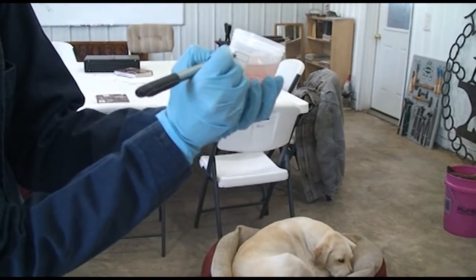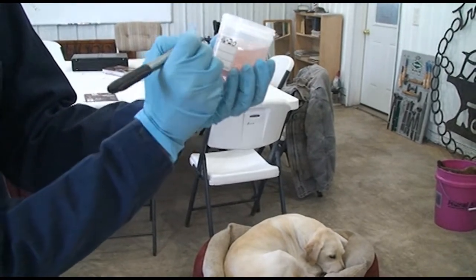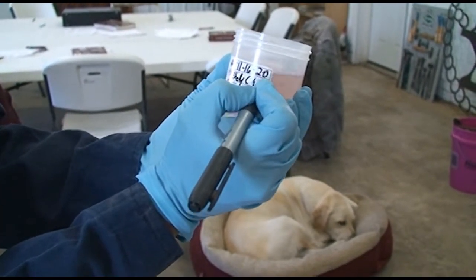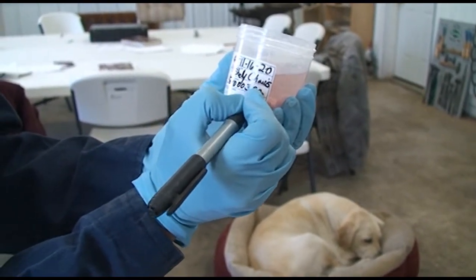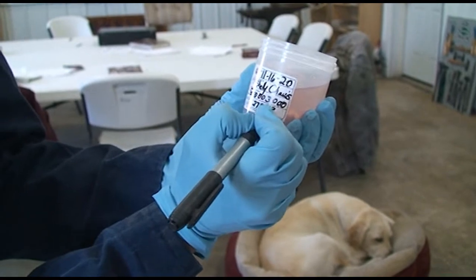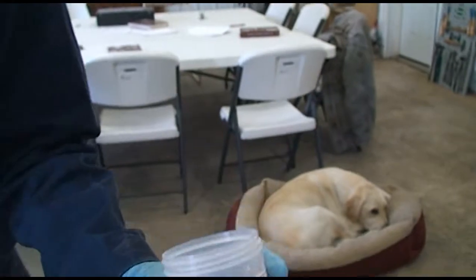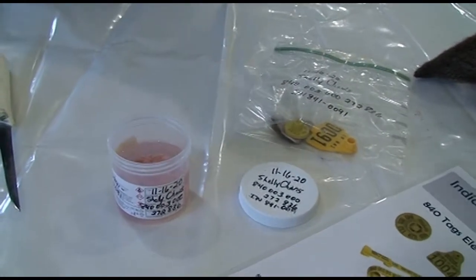And you don't have to use the sections that are listed on the formalin jar. You can just, the date's nice because it's there at the top, but then you can just put the name and your ID wherever you can on the jar. And so you've got the name, date, and the identification on the jar.